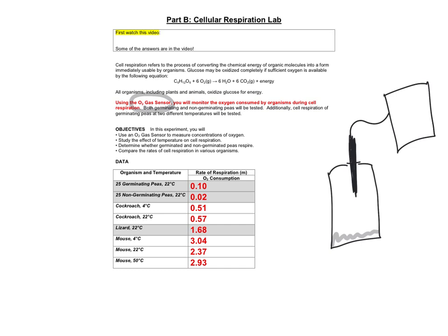Some of you would be able to bring in small pets if you have them, if they fit in the bottle, and it's no harm to the pet. It's always kind of a fun day. You can bring in your little critter, put him in the bottle for a few minutes, and collect data for respiration rate. In this part of the lab, we are comparing a few different types of organisms, so I would like to quickly define some terms for you, which are important when studying respiration rate.